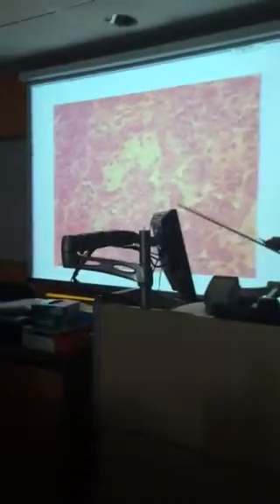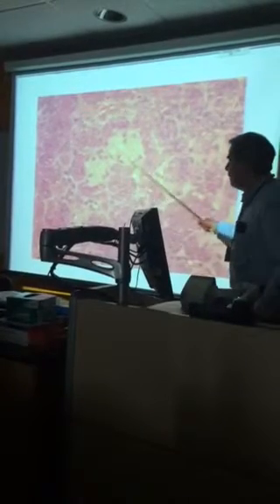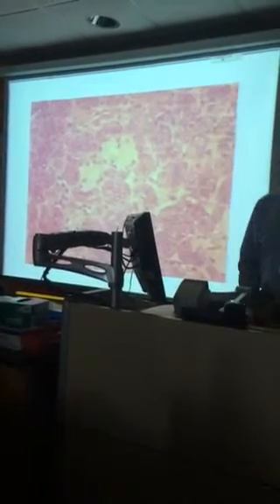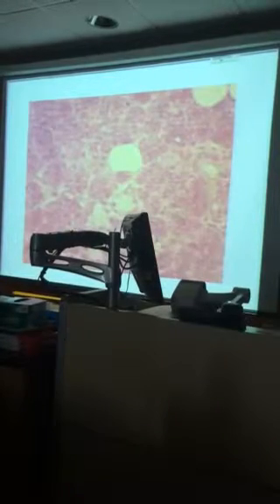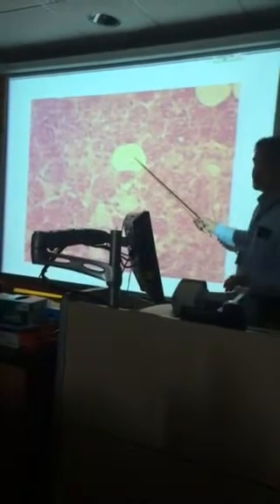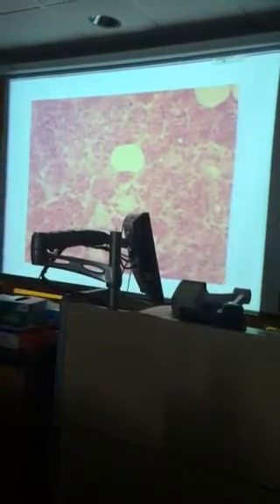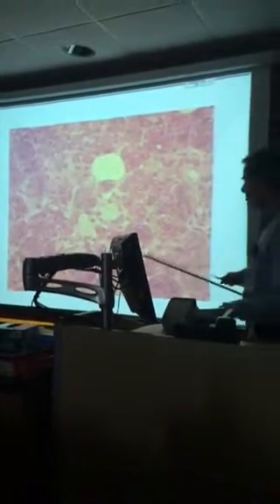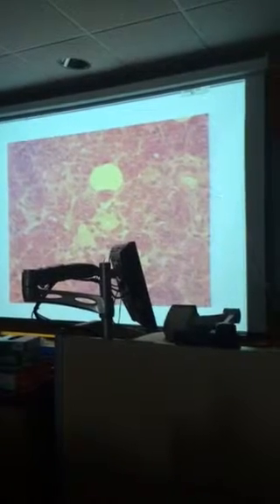Okay, again, the dark stained cells are serous cells, like we saw before, and these are kind of an off-white, almost gray color, the mucus cells. See, they're not fat. Okay? This is fat. That's a fat cell. Here's another fat cell. They just look like big empty spaces. You can see they look considerably different than the mucus cells, which have something in them. And again, the dark stained serous cells.